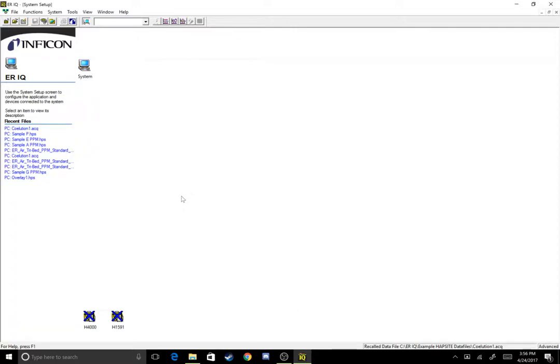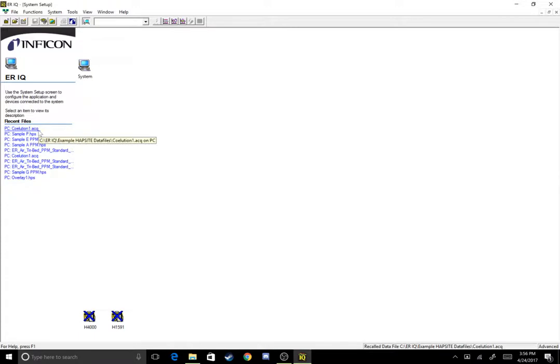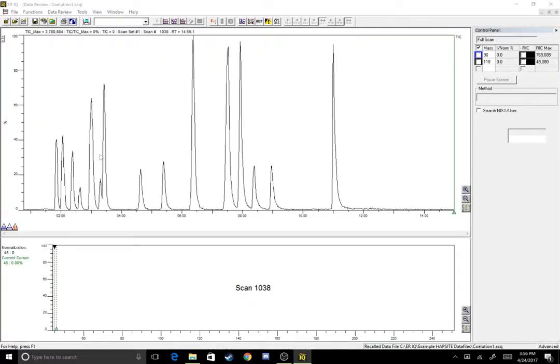So today we're going to talk about identifying and then dealing with co-eluting compounds on your GC mass spec. Just to define co-elution, that's when two different chemicals come out at the same time in your chromatogram so you can't tell one from the other just initially looking at it. So I'm going to open up this coalition1.acq data file.